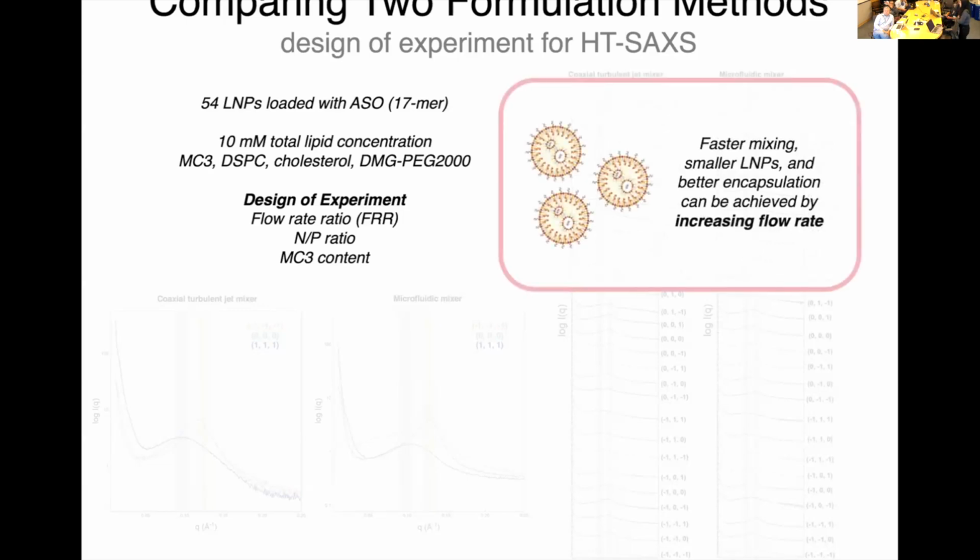And the flow rate ratio, we were varying because if we have faster mixing speed, that tends to lead to smaller lipid nanoparticles, and that also has been linked to better encapsulation efficiency. And so we were interested in seeing how that affects the internal structure of these particles.